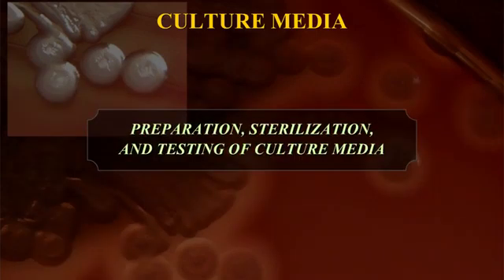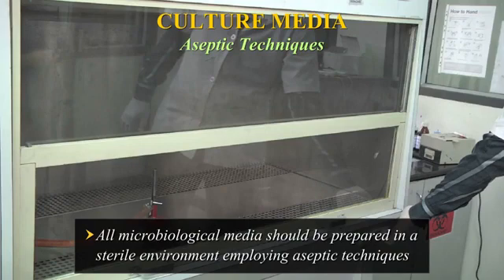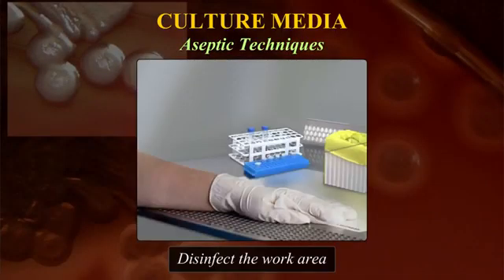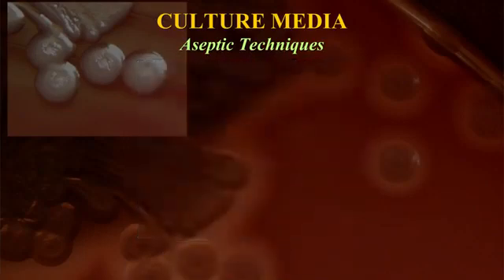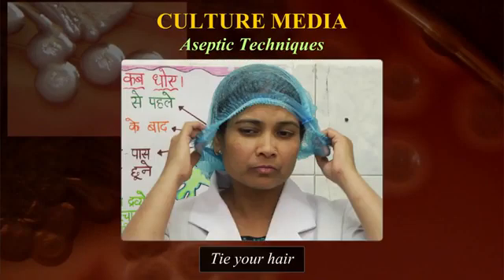Preparation, sterilization, and testing of culture media. Aseptic techniques. All microbiological media should be prepared in a sterile environment employing aseptic techniques. Disinfect the work area. Wash hands. Wear gloves, lab coat, and tie your hair.